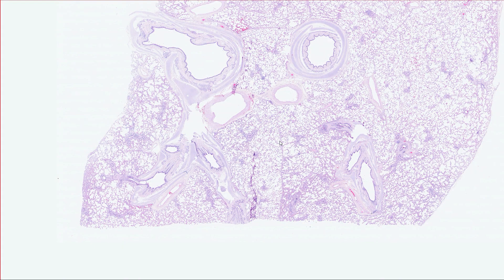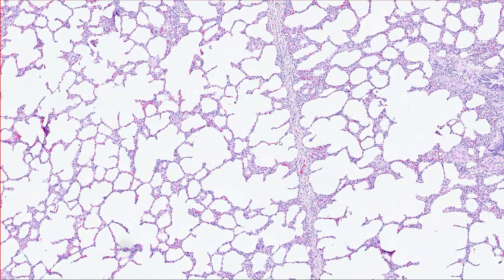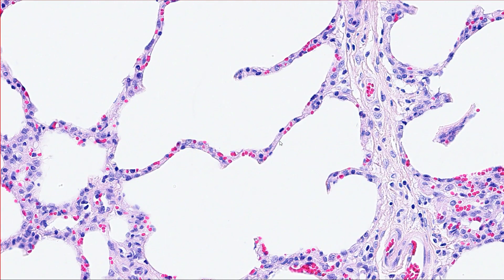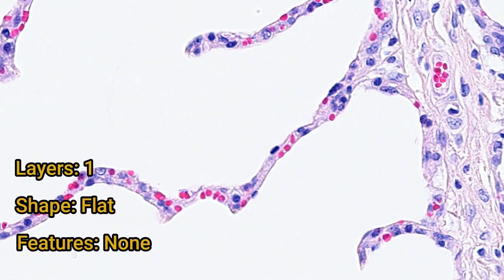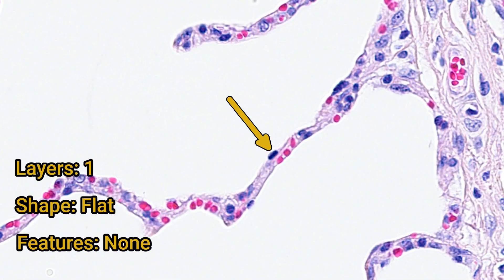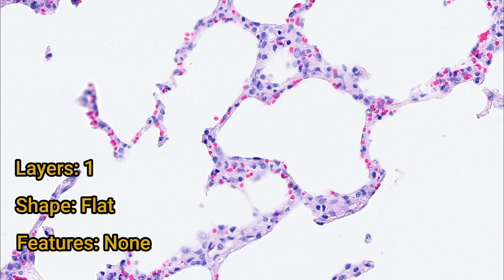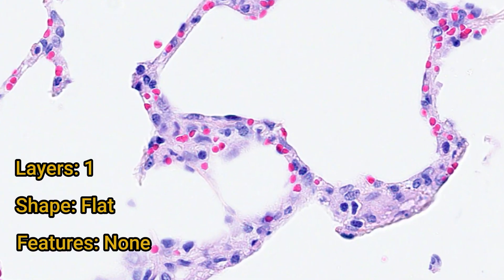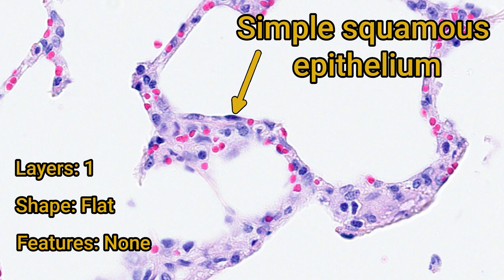Let's begin our journey in the lungs. There's lots of white space here that must be lined by epithelium. Looking at the alveoli, you can sometimes see a little flat nucleus sticking out into the alveolar airspace — this is the epithelium. There's a single layer, they're flat, and they have no special features. Epithelium with these characteristics is called simple squamous epithelium. You'll often find this type in areas where the body is trying to minimize the distance for diffusion, like the lung. These cells are so flat and thin they're impossible to see via light microscopy unless you slice through the nucleus.